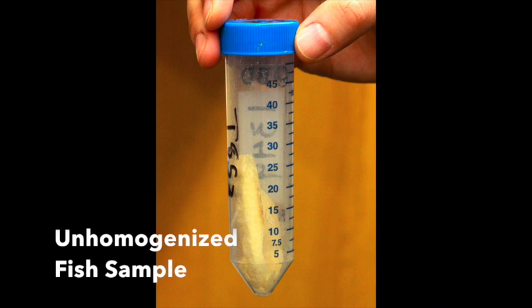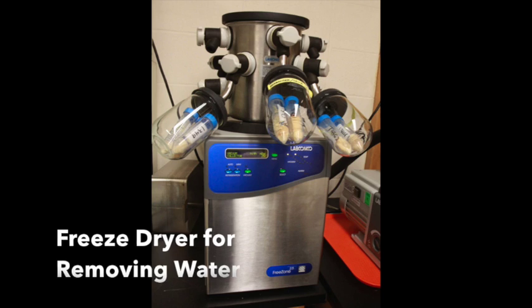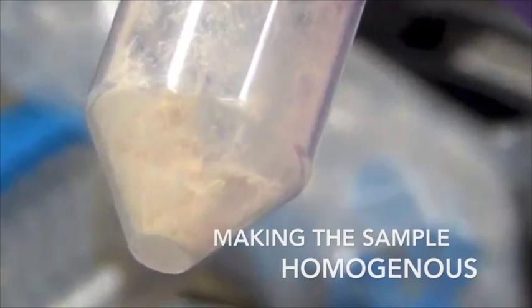After receiving fish samples on dry ice from Grand Lake, we freeze dried them first to remove the water content. At this point, the samples are very brittle, and we grind them into a fine powder to make each sample homogeneous.